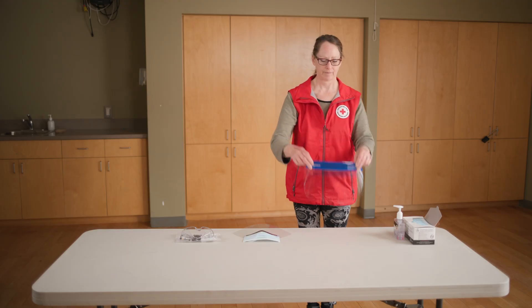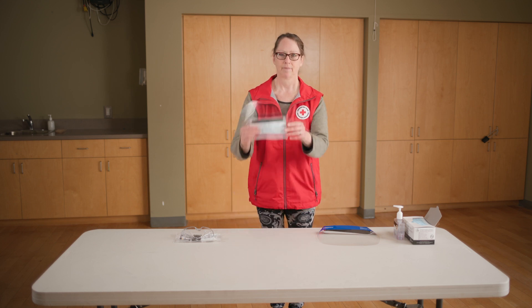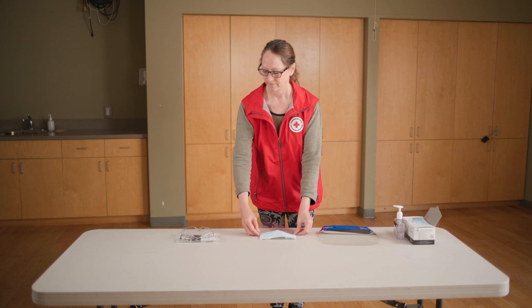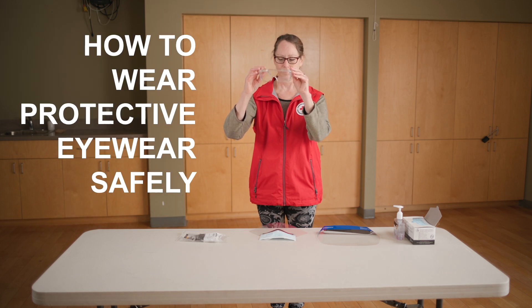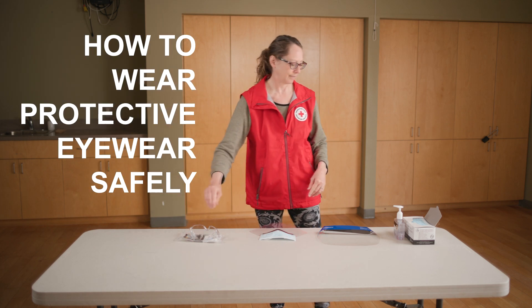It's important to know if your eye protection is disposable or reusable. If it's reusable, ensure you follow the required procedure to clean, disinfect, and store your eye protection between uses. While there are many types of protective eyewear, this video will show the common principles.